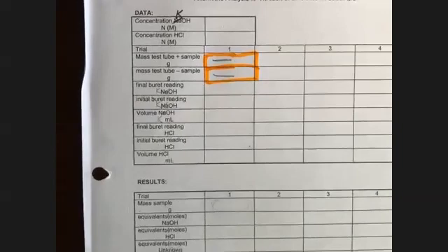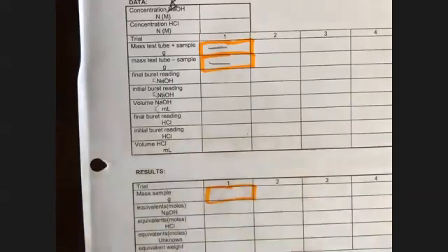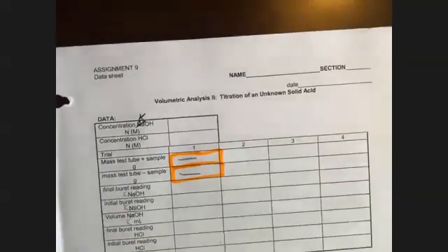I don't know if you see the same problem that I see with this procedure. My problem with that is that I know myself, and I'm pretty sure that if I try to do that, I will pour my sample from the test tube into the flask and I'll probably miss it. That means that not all of the sample that I delivered ended up in the reaction flask. So I'm going to change the procedures for that reason, okay? So let me show you what the procedures we're going to do are.